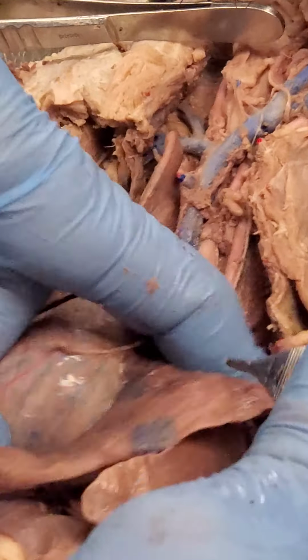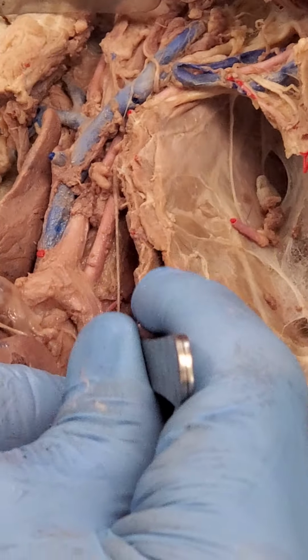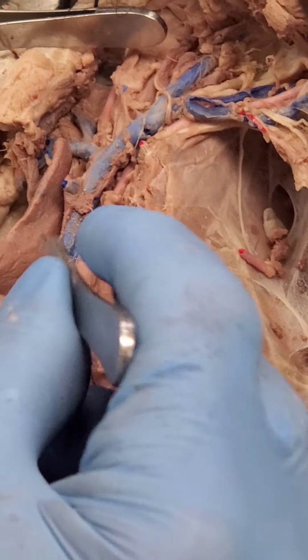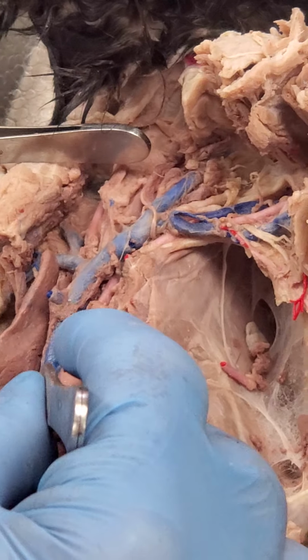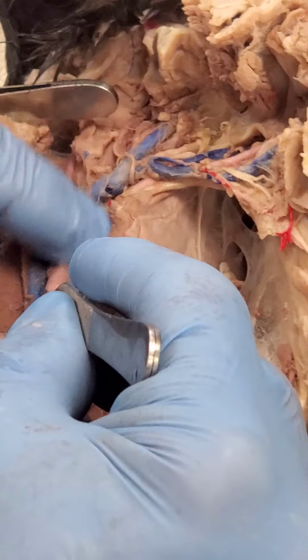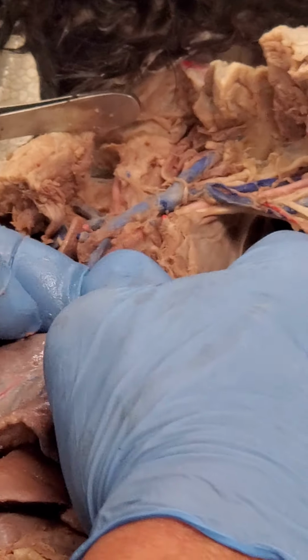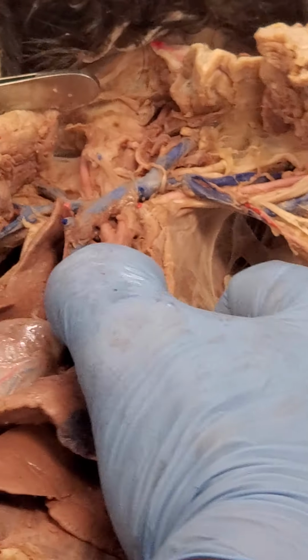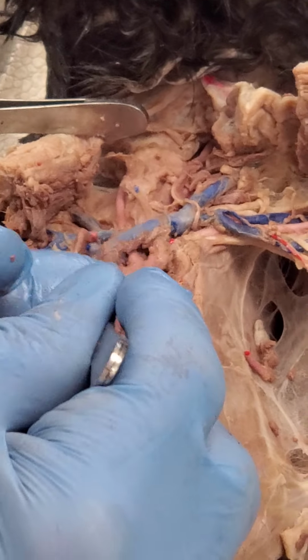The aorta, leaving the left ventricle, you can see that right here. See, it comes out, curves around. So that's the aorta. The arch has branches you need to know. You got 1, 2, a little different than a human. We got 3. This first big one is the brachiocephalic trunk or brachiocephalic artery. And if you pull it back a little bit, it looks a bit like a chicken leg there, doesn't it? So the brachiocephalic splits into 3.